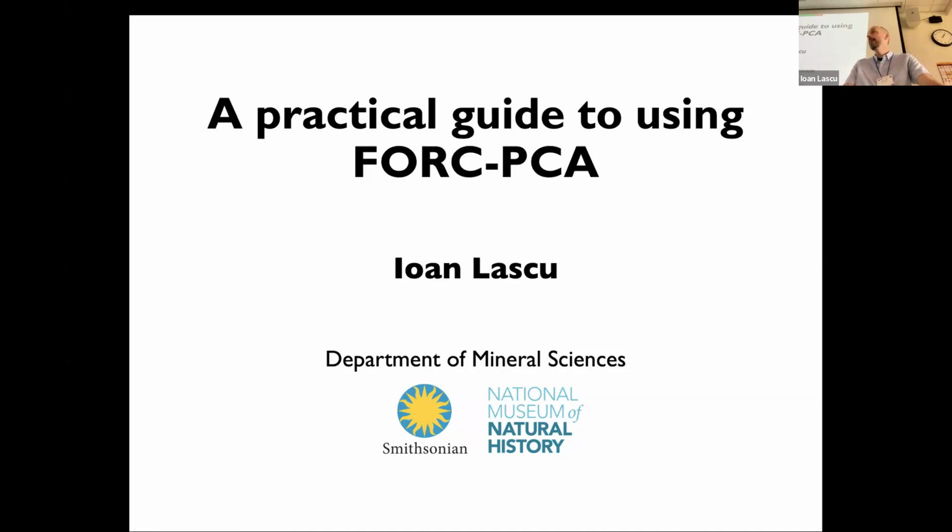My main objective today is to actually run through a data set and show you how to use FORC-PCA using FORCinel, which is a software that is used by a lot of people to process FORCs, but you can also use it to run this algorithm of unmixing FORCs. It is in Igor, which unfortunately, you have to pay for. But I think students can benefit from greatly reduced prices. Not that I'm advertising. I think it should be somehow open software, but this is what we have now.